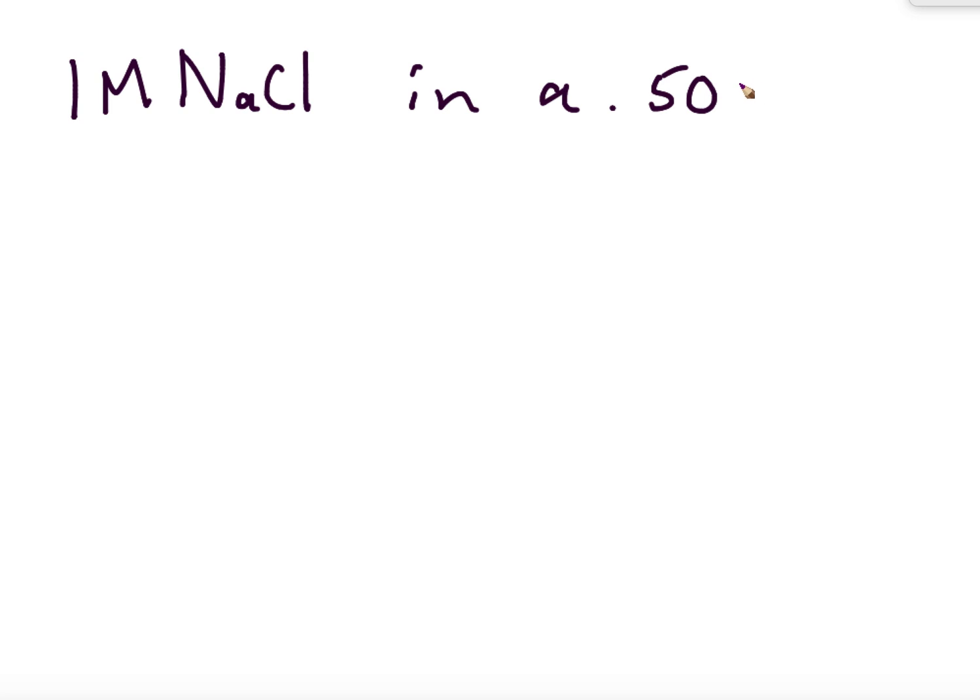Say I wanted to do the same thing, a 1 molar NaCl solution in a 500 milliliter volumetric flask.